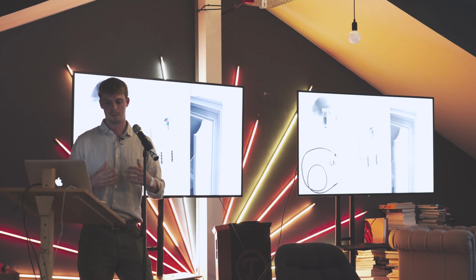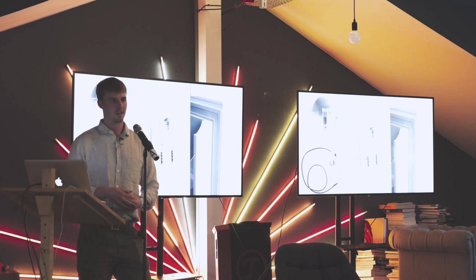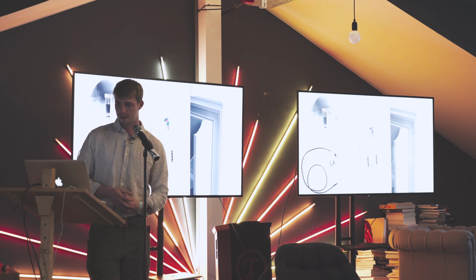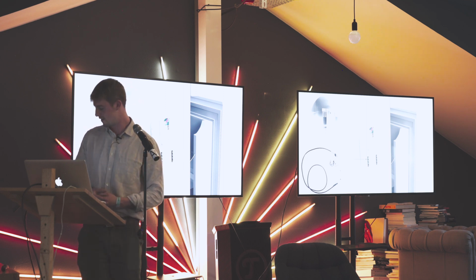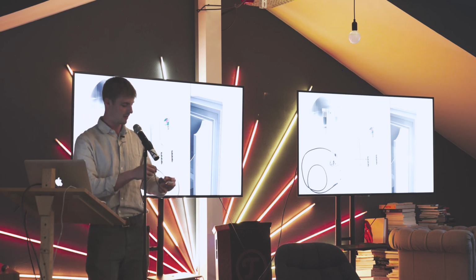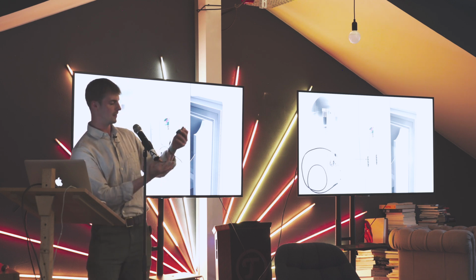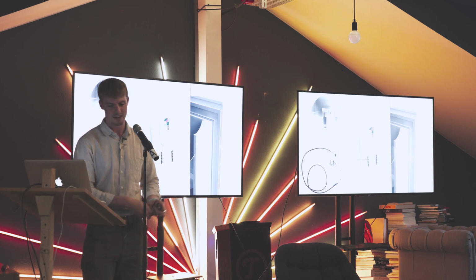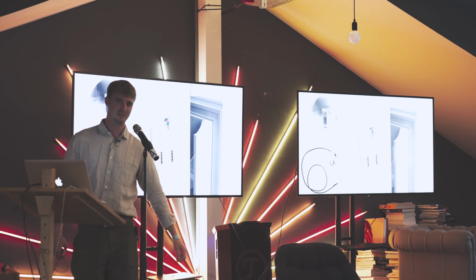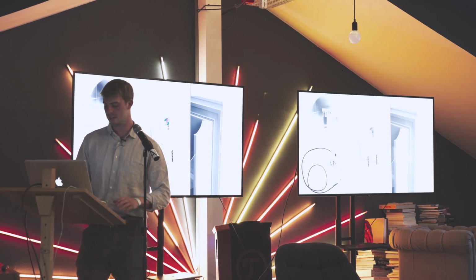When you compare that to the traditional gated communities, I think it's going to revolutionize the amount of data that you can get out for a specific price. So this is basically the idea. I've actually got one here as well, so you can see it in real life. It's a bit fiddly, and it's without its casing. I've got some casings over there, but this is the idea, and it's as simple as this, and it's 15 pounds. So probably about $17 off an open source website, and it's super easy to access.